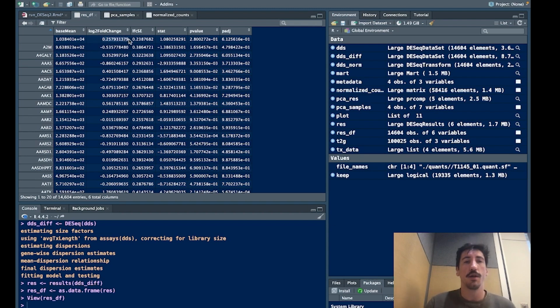Here we have log-fold change, which is really one of the most important metrics we're going to be looking at. And I won't dig into these too much, perhaps in a later video, but really the two columns we'll want to be looking at are log-fold change and p-adjust. And we want this to be below 0.05, which has corrected for multiple testing. And log-fold change, we tend to use -2 or +2 in my lab, but you can also use -1 and 1 depending on your analysis.